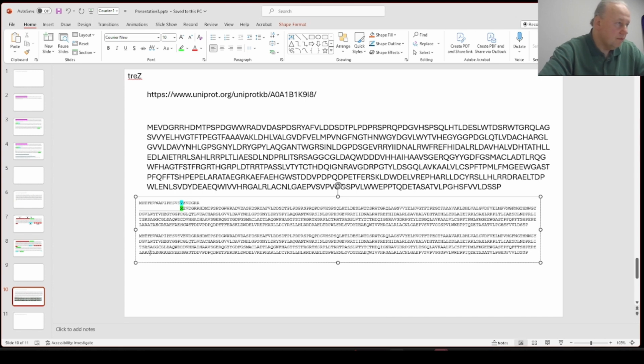Yes. Final correction. Yes. So that V is in fact a V, not a G. And this is one of those cases where automatic assembly of sequences results in a slight error. This may have been tolerated by the protein, I don't know. But I'd rather not find out experimentally where the protein is all bad and crashy and stuff. This is not the first time and probably not the last time. So, exciting stuff.